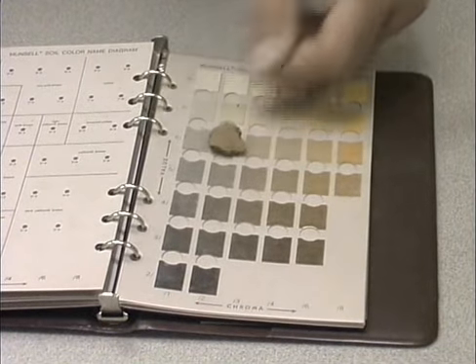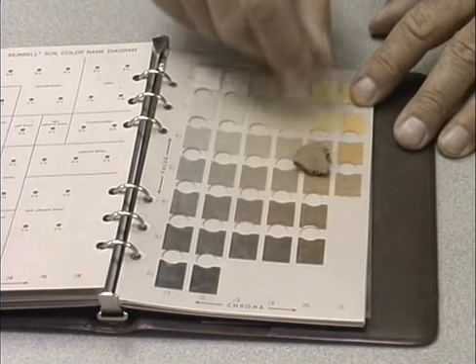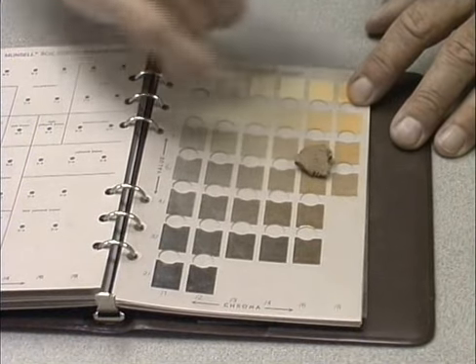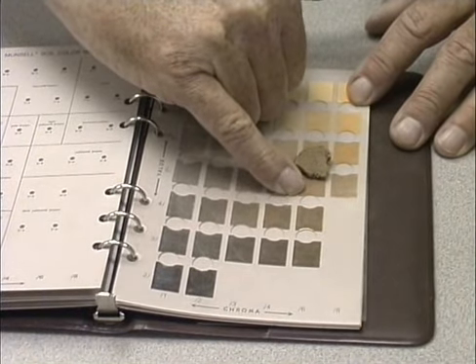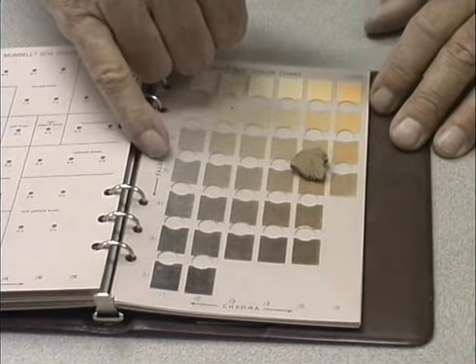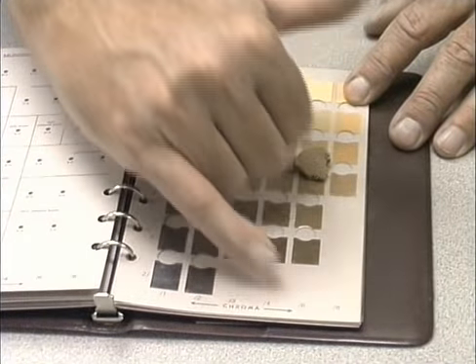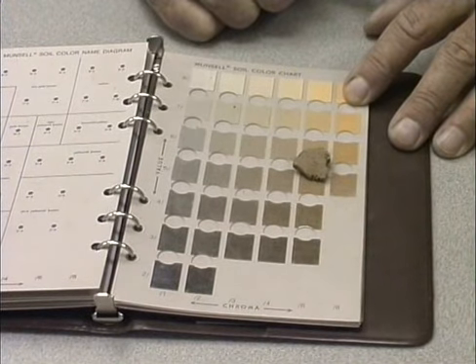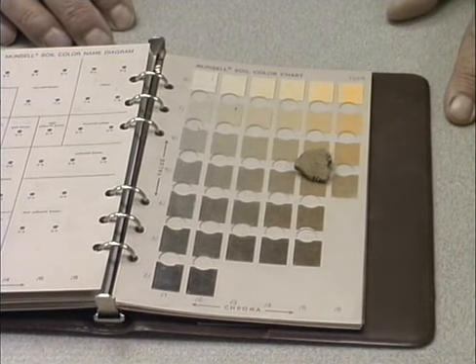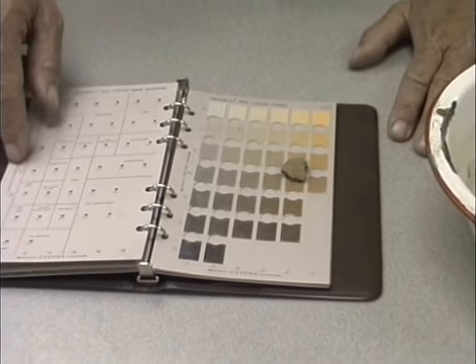As I read across this chart and I try to match them up, I see that I have a very light soil. It actually matches up the best with this particular color plate right here. So I'm going to be hue 10YR again, value 5, because everything in this horizontal row is a value of 5. Chroma would be 6. So for this soil sample number 2, we have a hue of 10YR, a value of 5, and a chroma of 6.